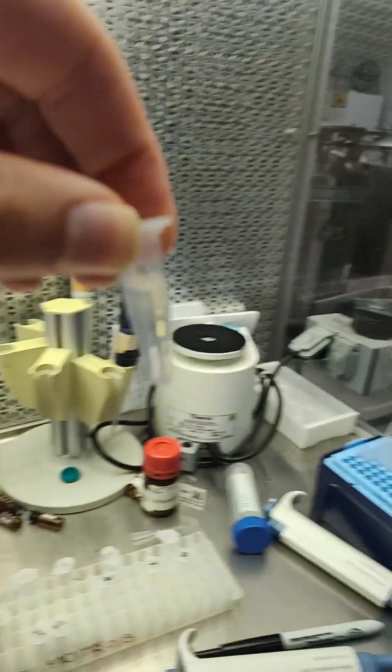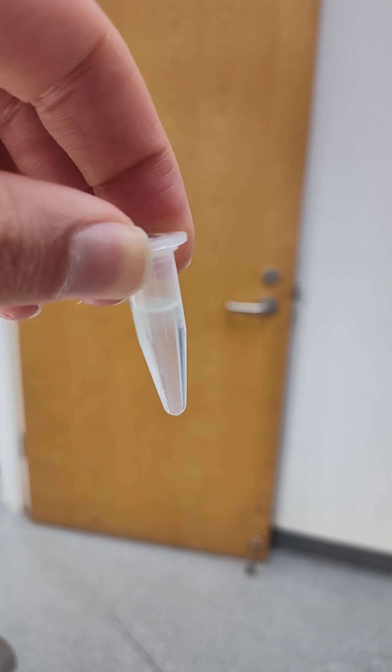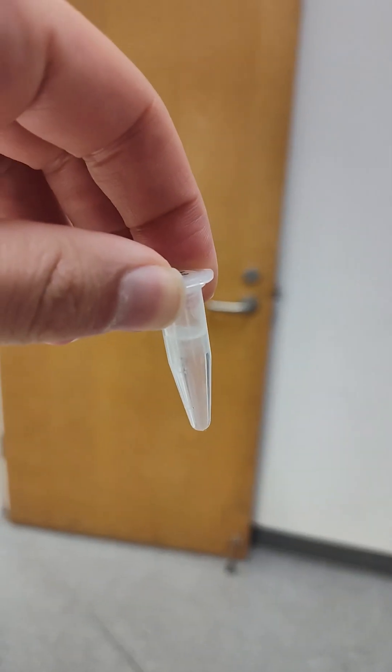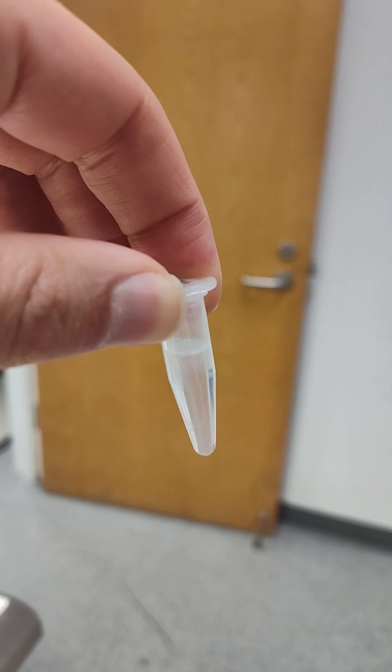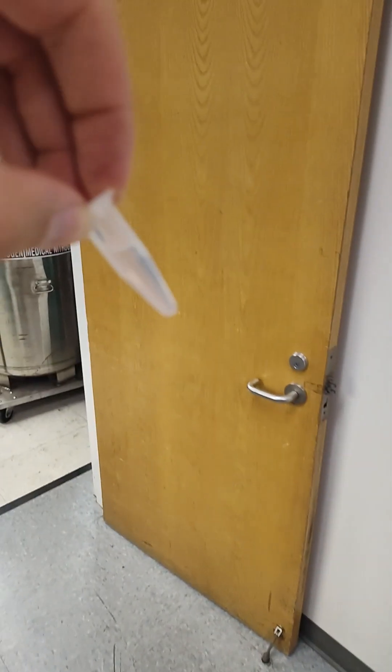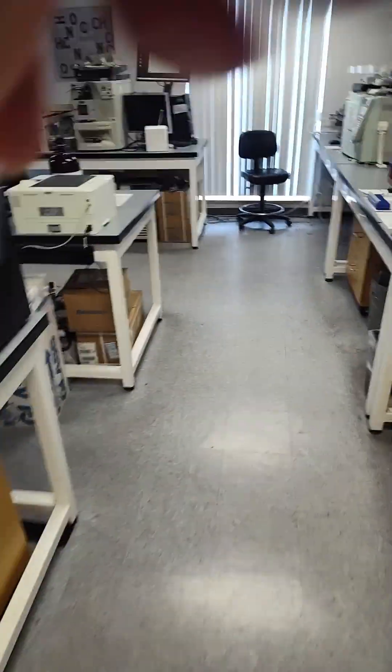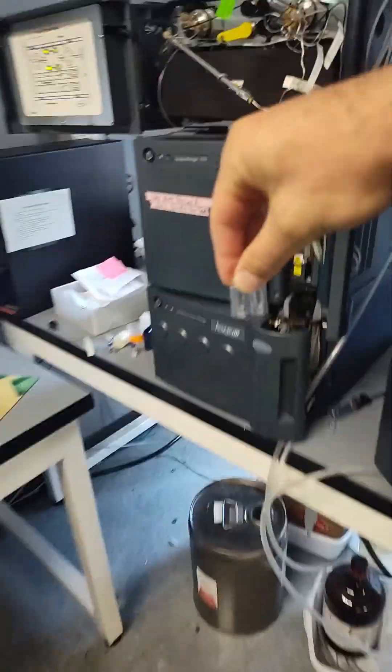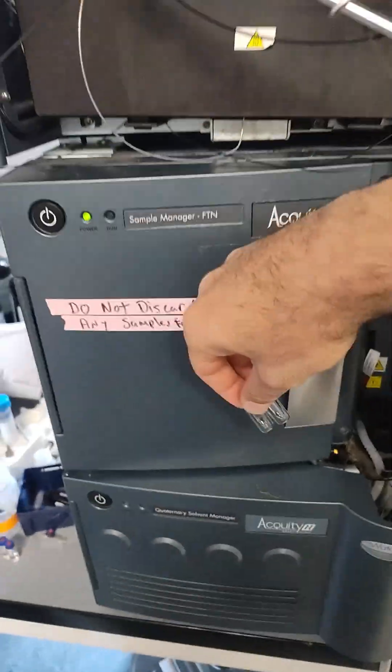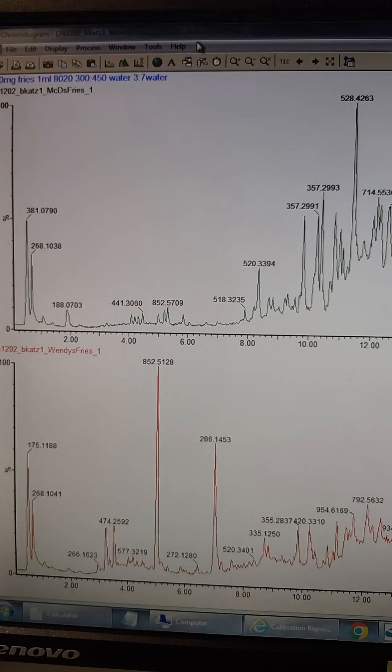Wendy's off for a second time. This is a really odd looking grease sample. It's got like a floaty grease on top. Strange. McDonald's looks pretty clear. Those are clear. Wendy's versus McDonald's french fries. We're specifically looking for the green potato toxin. But then we'll look for all the other differences too.